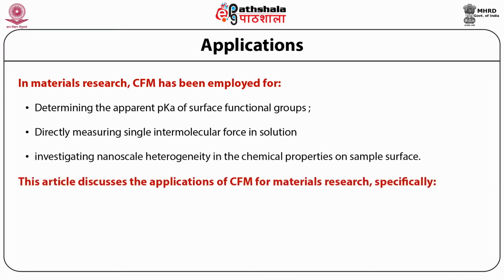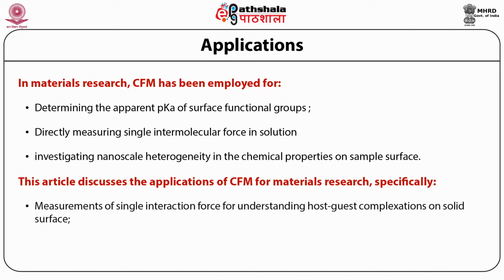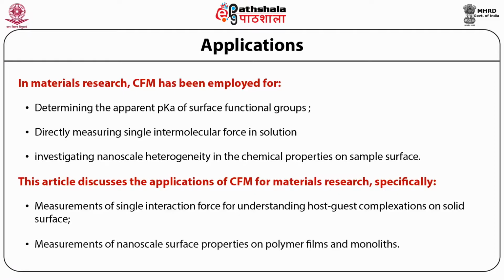This article discusses the application of CFM for materials research, specifically, number one, measurement of single interaction forces for understanding host-guest complexation on solid surfaces, and number two, measurements of nanoscale surface properties on polymer films and monoliths.